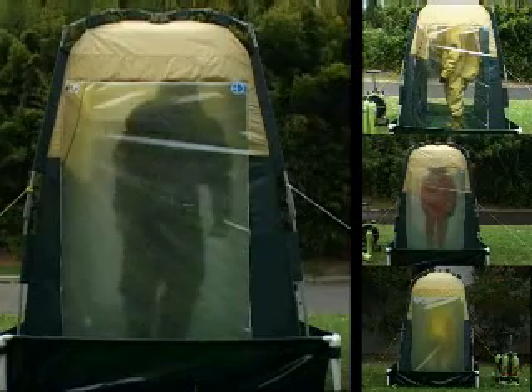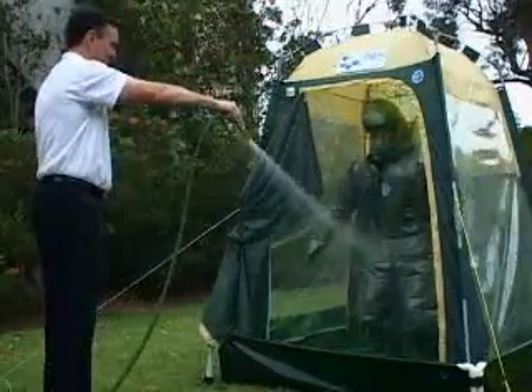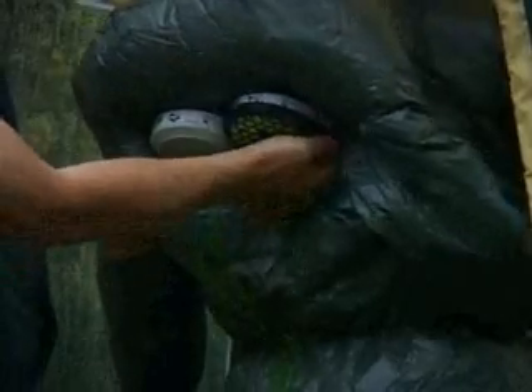The body movements are the same for all suits. Each test lasts for a full five minutes. It's been a thorough soaking. Now the test subject is sprayed with lots of water, which simulates decontamination in a real situation. Under UV light, every tiny droplet of the fluorescein dye shines bright yellow.